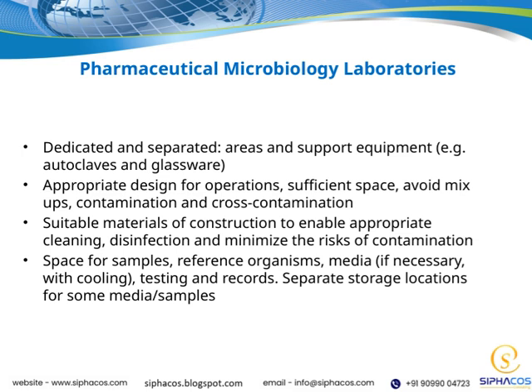These materials should allow for effective cleaning and disinfection, which helps minimize contamination risks. Think of it as creating an environment that's easy to keep sterile and controlled. Lastly, we need enough space for everything: samples, reference organisms, media, sometimes even with cooling if necessary, testing, and records. And it's important to have separate storage areas for certain media and samples to prevent any accidental mix-ups or contamination.